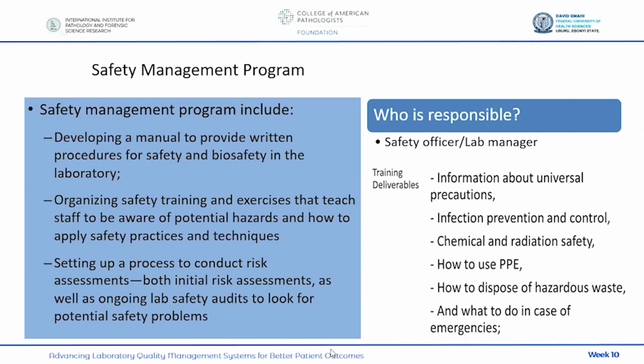When it comes to disposal, especially for the lab attendants, the cleaners, they should be specifically trained on disposal. But not only the cleaners, every other personnel in the lab, because waste disposal starts from segregation. So you should know where to drop waste before the lab attendants, the cleaners, begin to dispose. So everybody should be aware of disposal of waste and how to do that properly. And very importantly too, every lab personnel should know what to do in case of emergencies. So you can see that when it comes to safety, nobody takes a backseat. Everybody takes action, and safety is everybody's business.